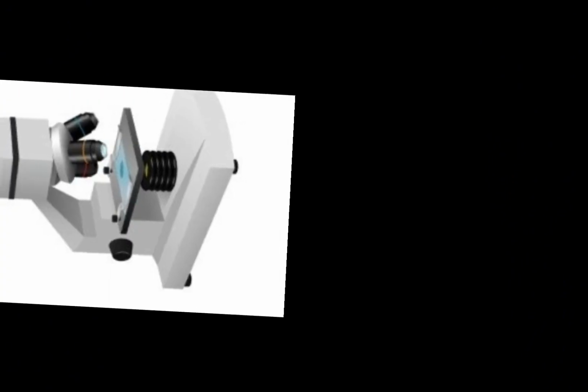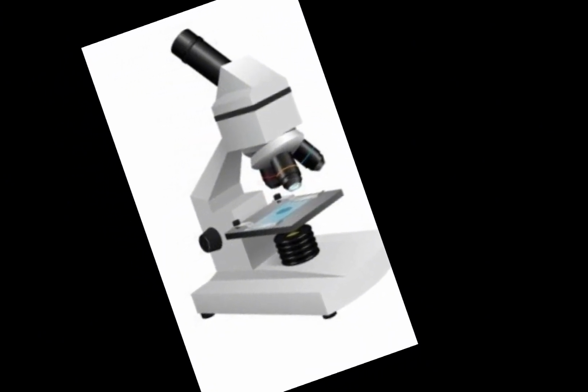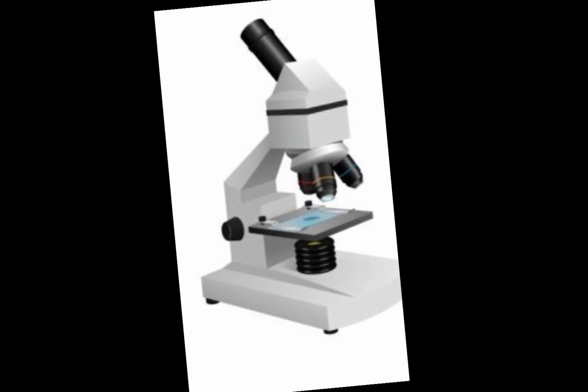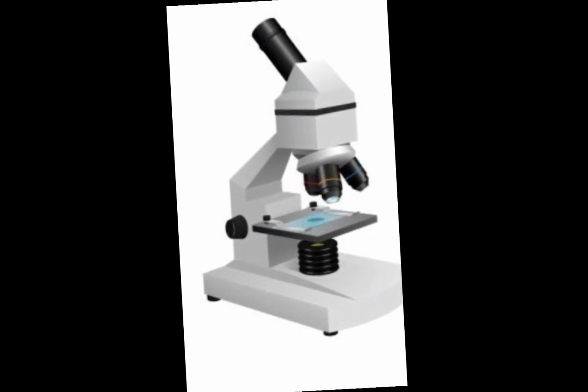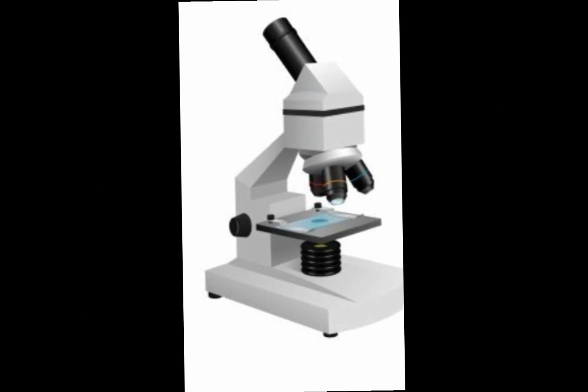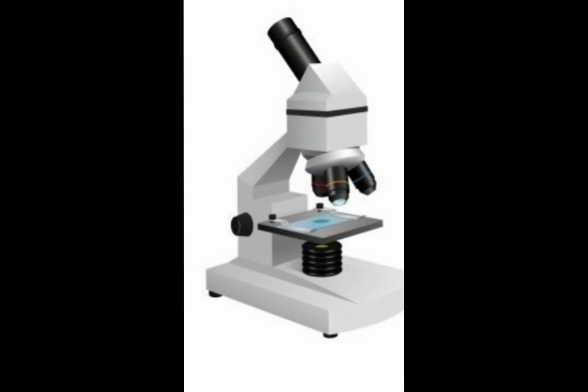Although onions are plants, you will not see any chloroplast in their slides. This is an easy and fun activity that will allow the students to learn about cell structure. Students have the opportunity to experiment and observe onion membrane with iodine, methylene blue, and without stain, and observe the differences.